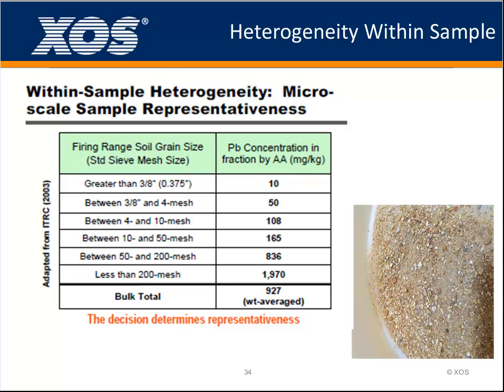But when we send this sample to laboratory, the laboratory will process the sample, and will analyze the average result of small particles going through 60 mesh in the US and 100 mesh in China. So with XRF, we test directly, and the sample sent to the laboratories, we are analyzing different samples. So generally, sample result will not be the same just because we're analyzing different samples. But if we're analyzing the same samples, probably we can get similar results.